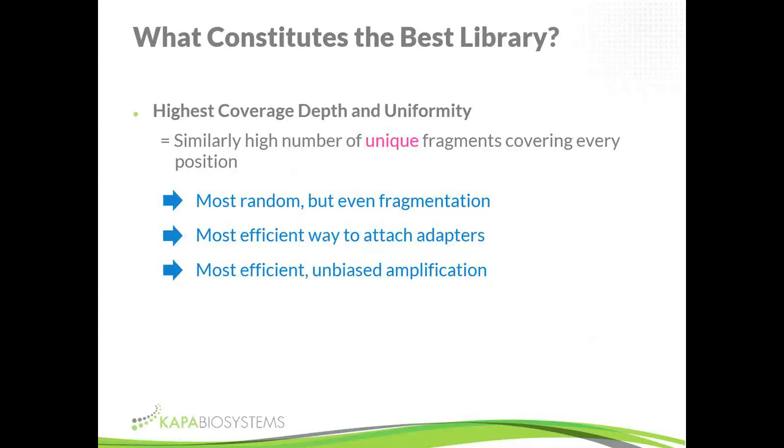And then if we do have to do library amplification, that is either mandatory for the method we choose or is optional, but may be determined by adapter design. If we have to amplify the library, or if we just need more for the next step in the process, we have to make sure that we do it in the most efficient and unbiased way.